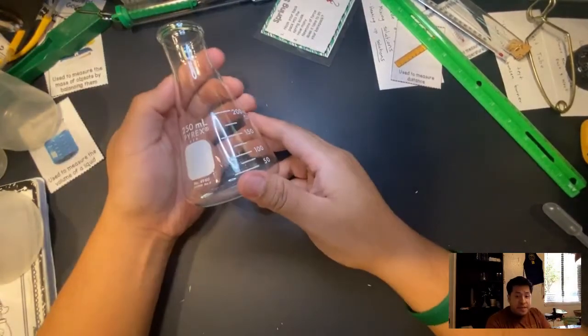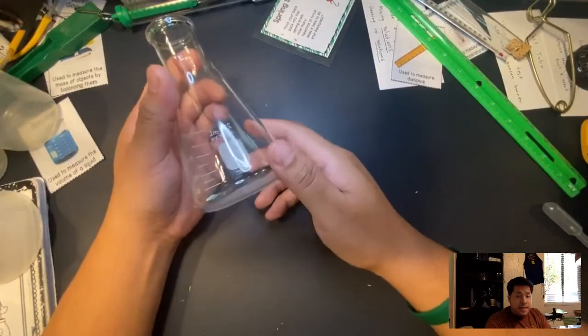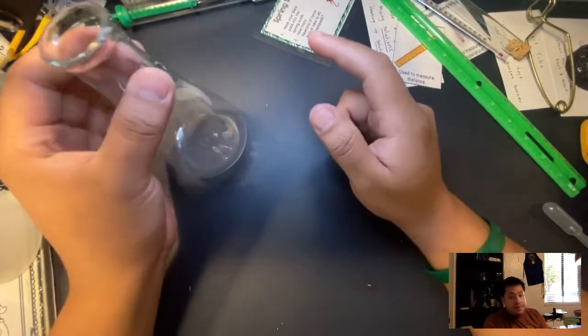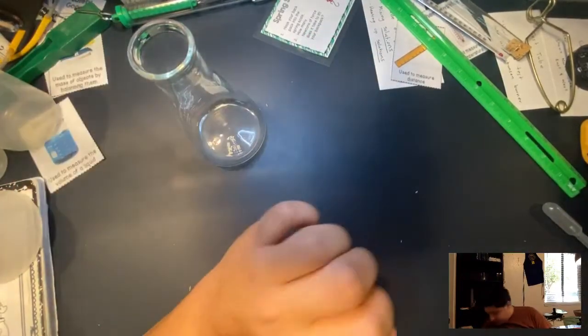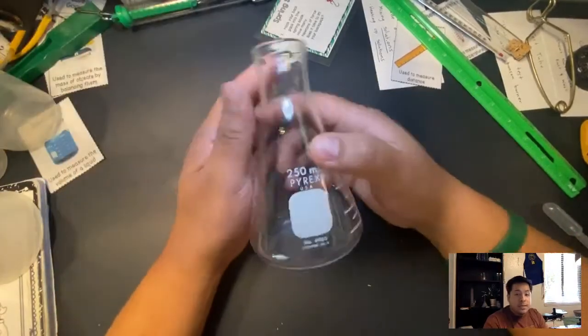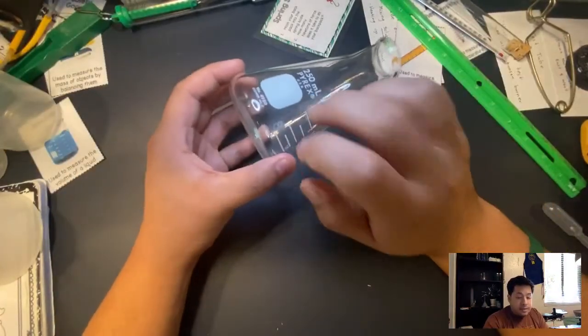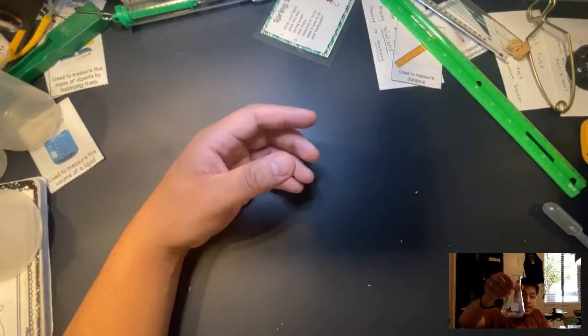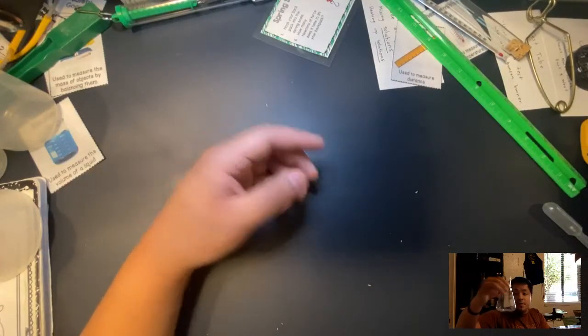This right here is a flask. I can put different solutions inside the flask and then place it on top of the hot plate. This flask is made out of glass and goes up to 200 milliliters.